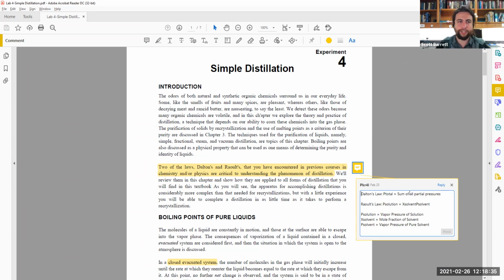And these equations, I've already had other sections or other people ask me, where do we utilize this? I would just have these equations placed into your lab notebook as a formality of understanding the experiment itself, rather than to have to be utilizing this, because we won't necessarily be using Dalton's law, Raoult's law in order to calculate much in the experiment. So I would just go ahead and have that in your lab notebook for formality of stating that that was in the lab manual.